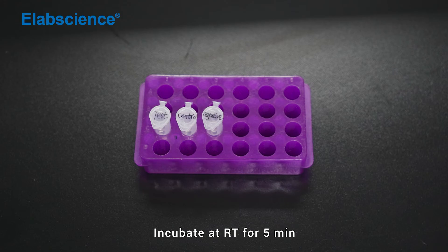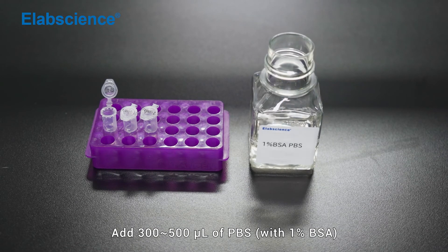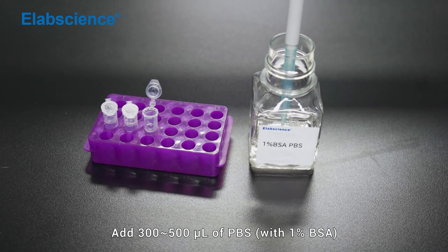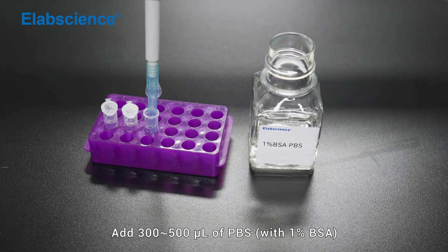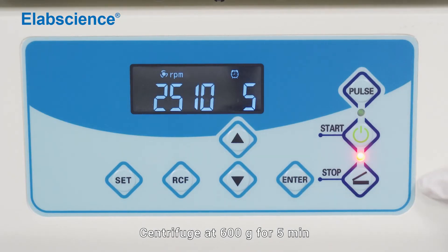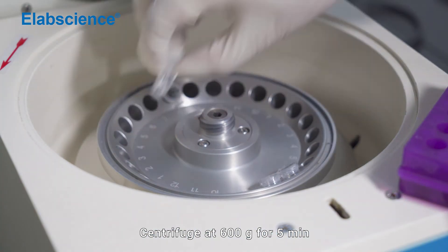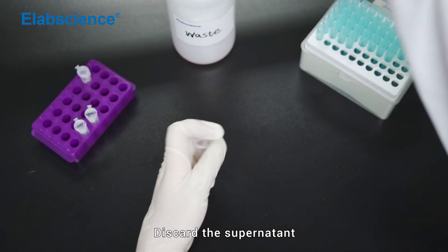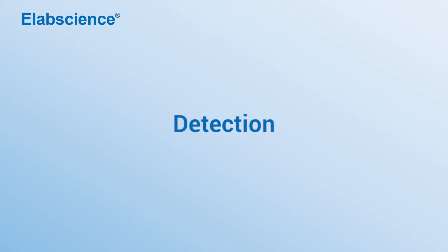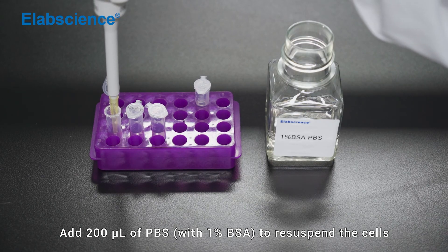Add 500 µL of PBS. Centrifuge at 600×g for 5 minutes. Discard the supernatant. Detection: Resuspend cells in 200 µL of PBS and proceed to flow cytometric detection.